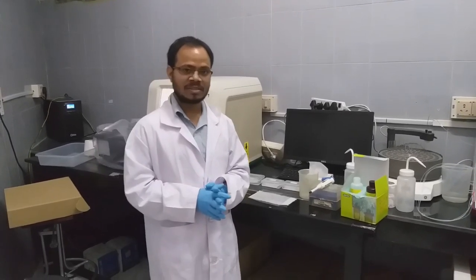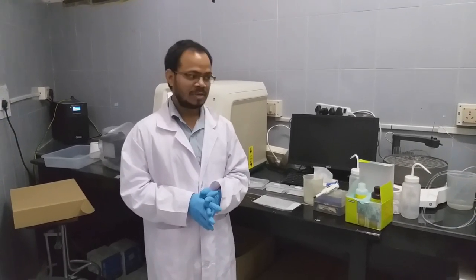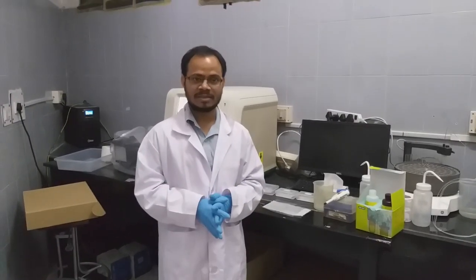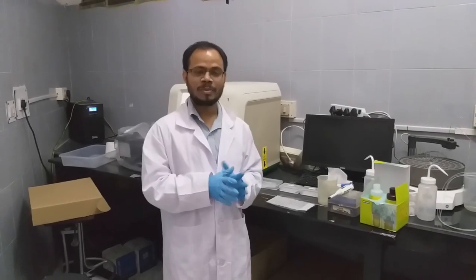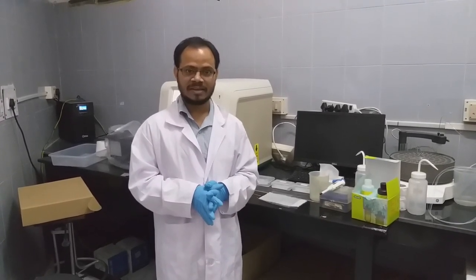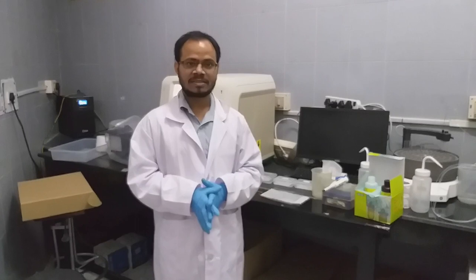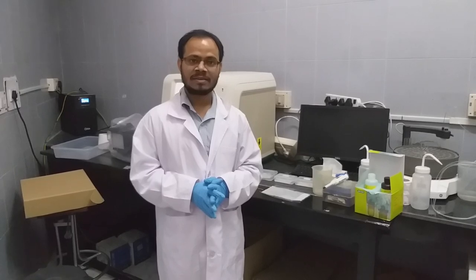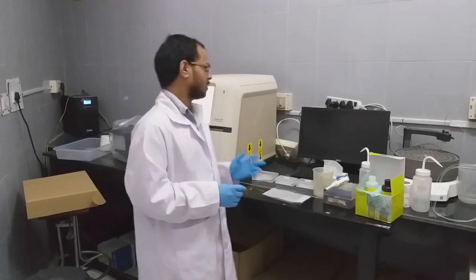Luminol, in the presence of hydrogen peroxide and the peroxidase enzyme present in the horseradish peroxidase conjugated secondary antibody, is converted by the horseradish peroxidase to excited state luminol by deprotonating and oxidizing it. This excited state product gradually releases its energy by emitting luminescent photons. That light will be detected using this instrument.